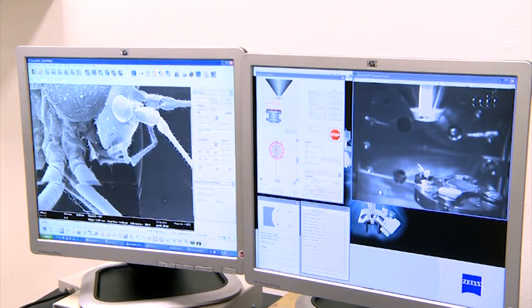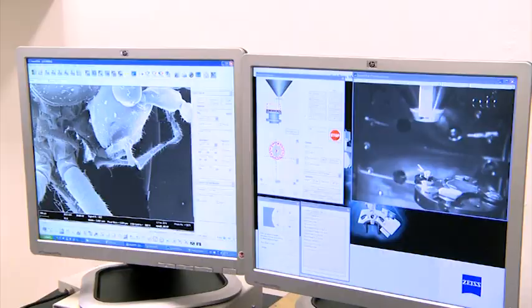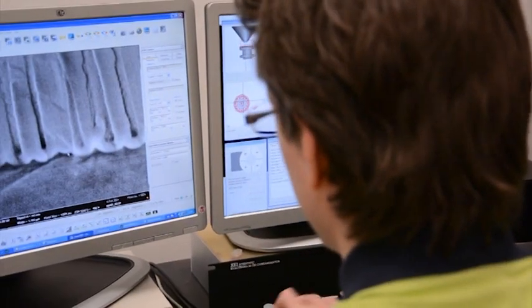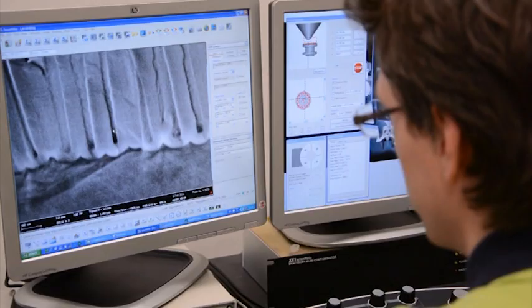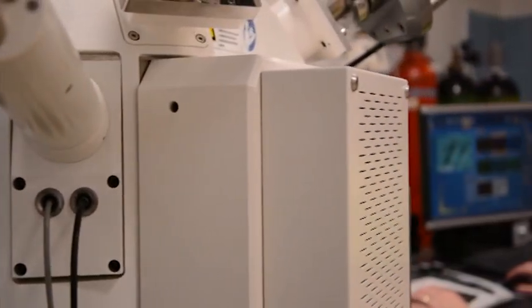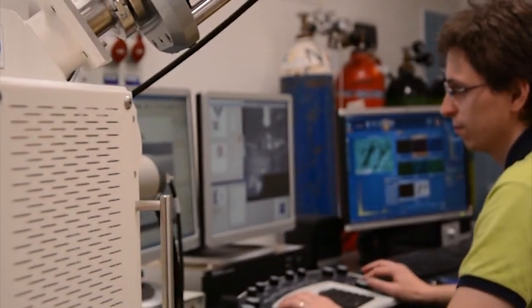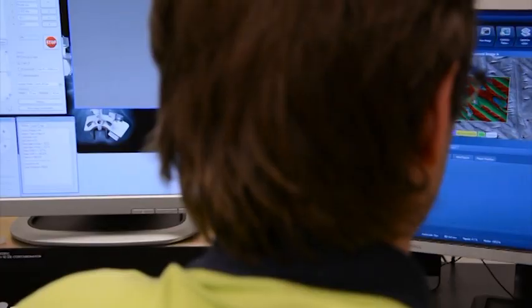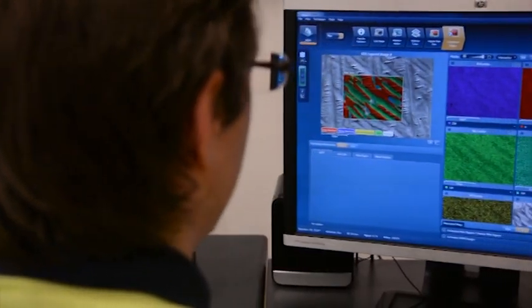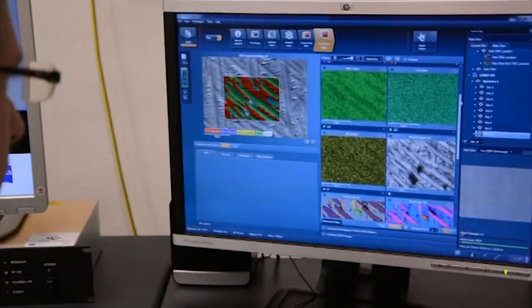Umožňuje zobrazení detailů o velikosti řádově jednotek nanometrů a je schopen také zobrazovat s vynikající hloubkou ostrosti. Mimo vlastní zobrazování je možno provádět velmi přesné lokální i plošné chemické analýzy a analýzy fázového složení pomocí elektronové difrakce.